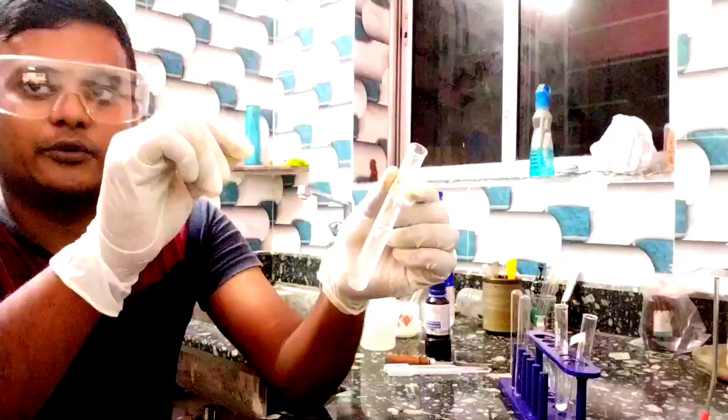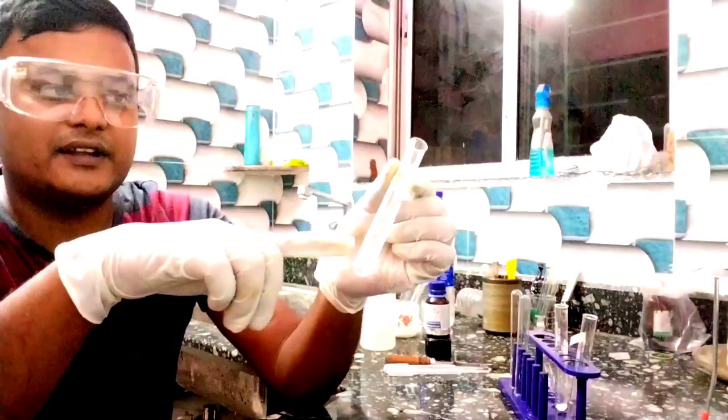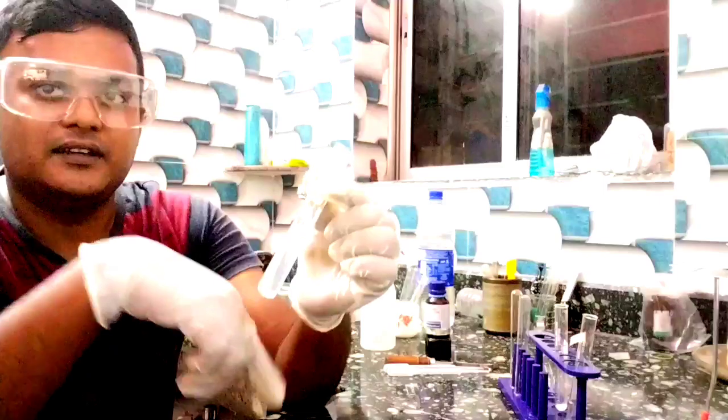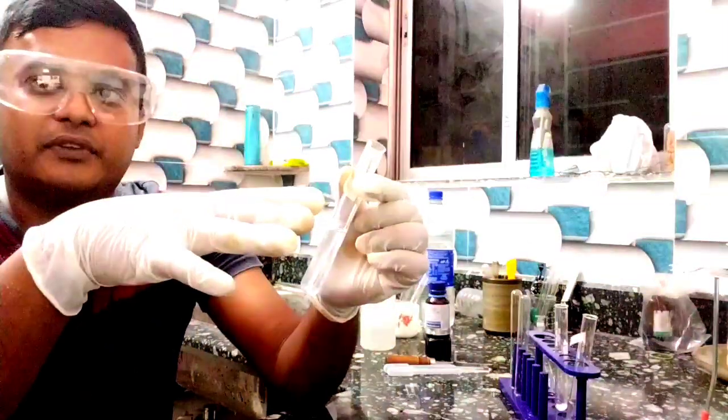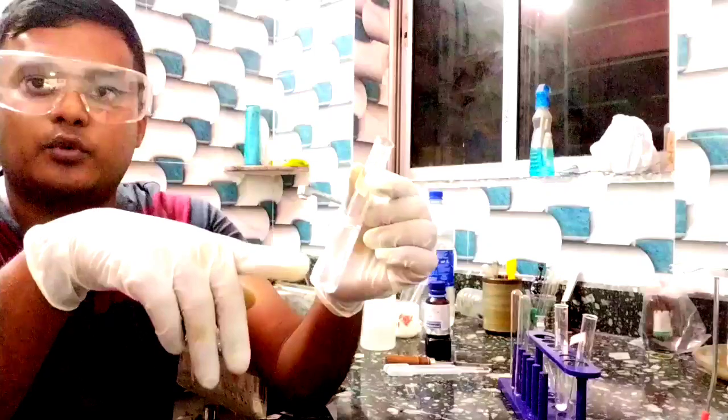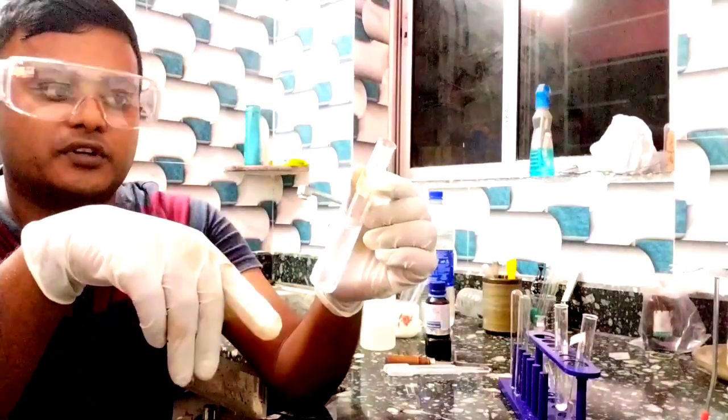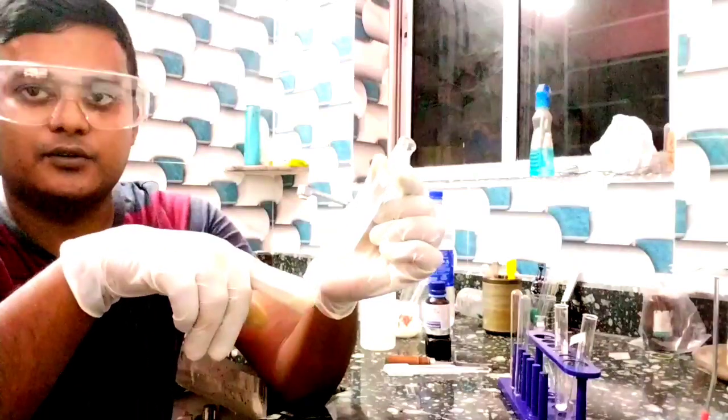If we heat it, it will dissolve completely because we know that lead chloride is soluble in hot water. This is quite specific - lead chloride is soluble in hot water. So that little bit of white color is due to chloride present in normal tap water. Don't get confused.